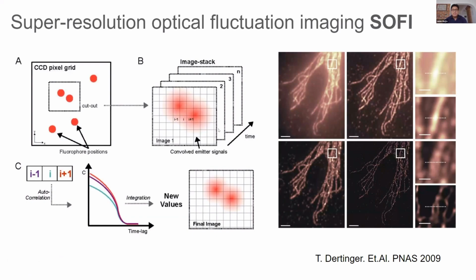One of the main disadvantages of SOFI, I would say, is that it requires a lot of frames. That is another feature that is important to keep in mind when we are exploring these super resolution methods. Some methods need fewer frames in time, and other ones need more frames. SOFI is one of those that needs the most to do this high order statistical analysis of the images.